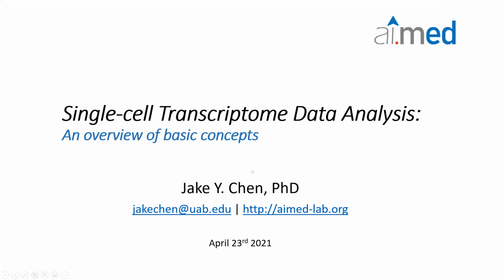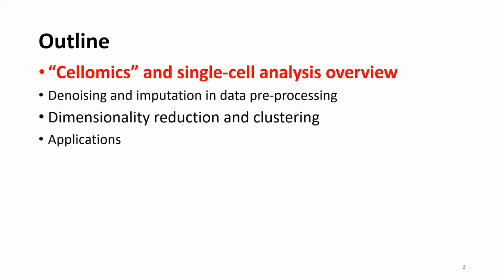So what I'll do is give an overview of single-cell transcriptomics analysis. Here's my outline. I'll start with cellomics and a basic overview of the concepts in single-cell analysis. Then I'll go into a little of the concepts in data preprocessing, and why we need to do it.